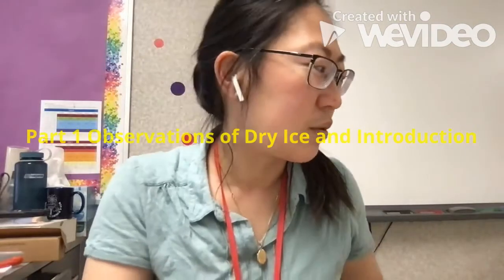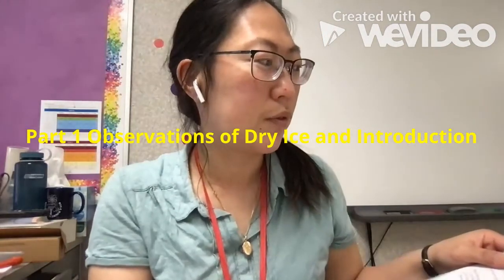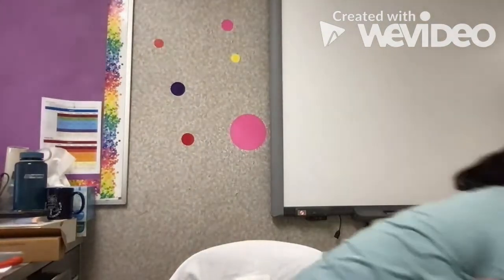All right, so we're going to start with part 1. It's just an observation of dry ice. Number 1 says, what chemical is dry ice? If you don't know, look it up, but it's solid carbon dioxide. And I'm going to get some dry ice for you to look at. Okay, so here it is.